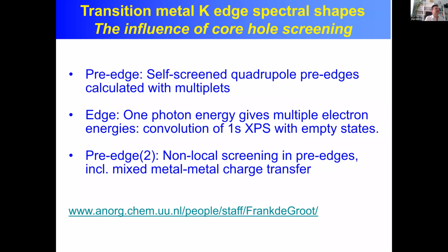So that's something. Frank, this is Lin Chen. I was the one who asked that question. I just want to see, for instance, like TiO2, you see they're supposed to have a T2g and Eg. However, you see the third peak. So that was assigned as a shake up, shake down. And also for the cobalt oxide, there's also an extra peak as you show. So I would like to get your opinion on that. Thank you.